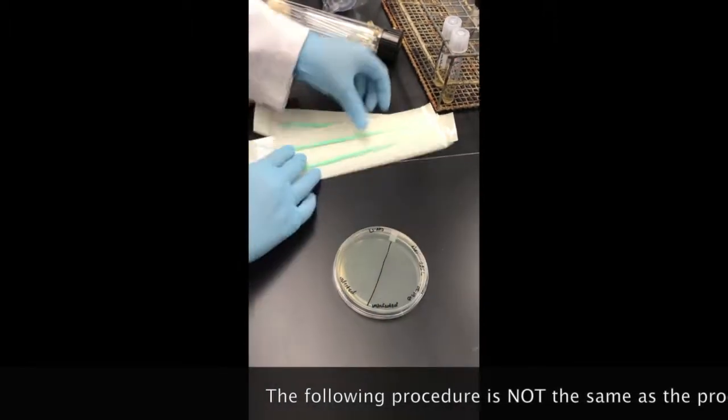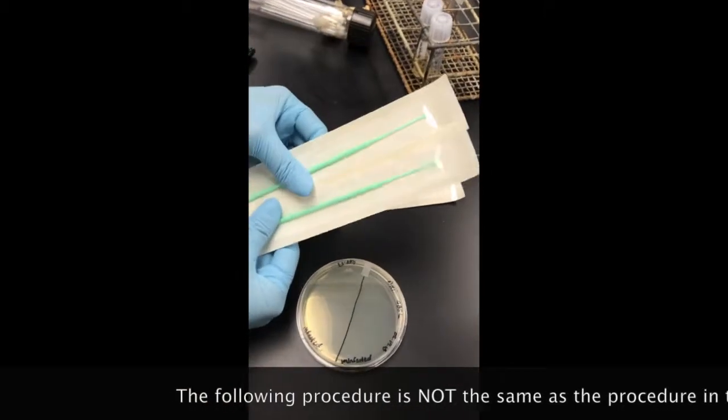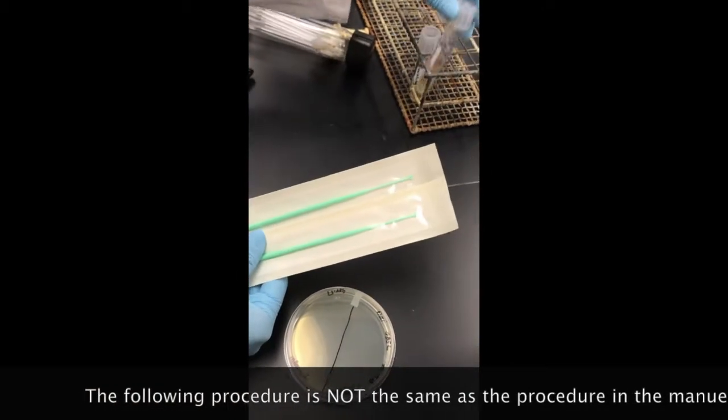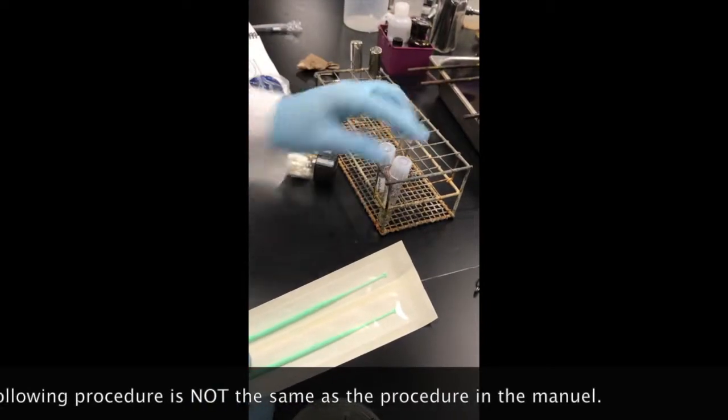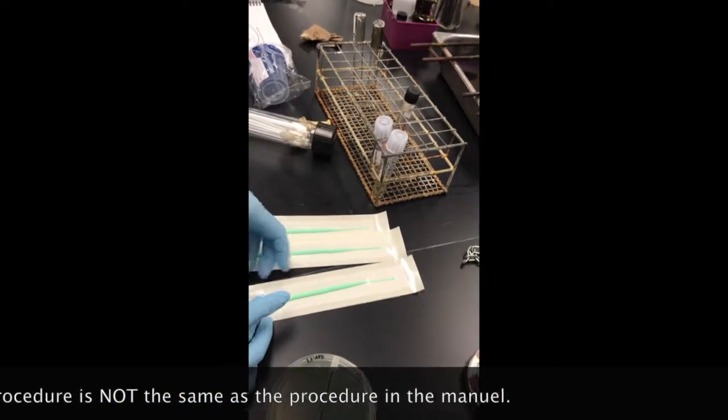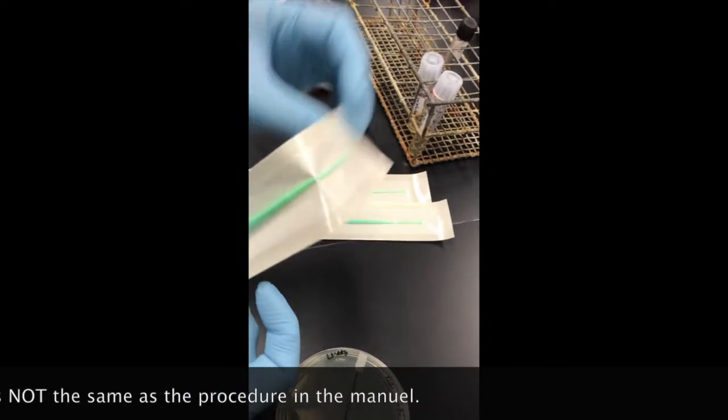And what you're going to do is you're going to use these pre-calibrated loops to add the right amount of each sample onto the plate. And be careful not to break your loop because then you can't use it.